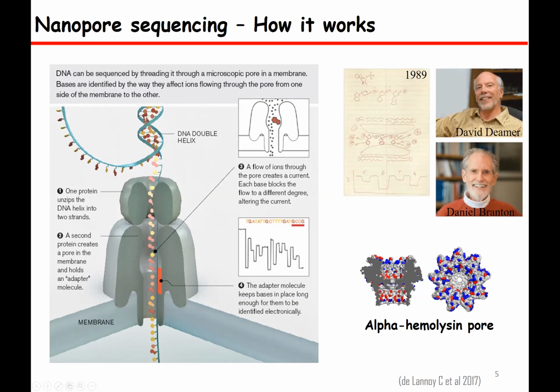This nanopore protein was then genetically engineered to pass the DNA at a pace of at least 400 bases per second, which makes it possible to sequence in a high throughput manner. So overall, the concept of nanopore sequencing is that it works on changes in the flow of ionic current, which leads to different graph structures, which can then be base called to bases.